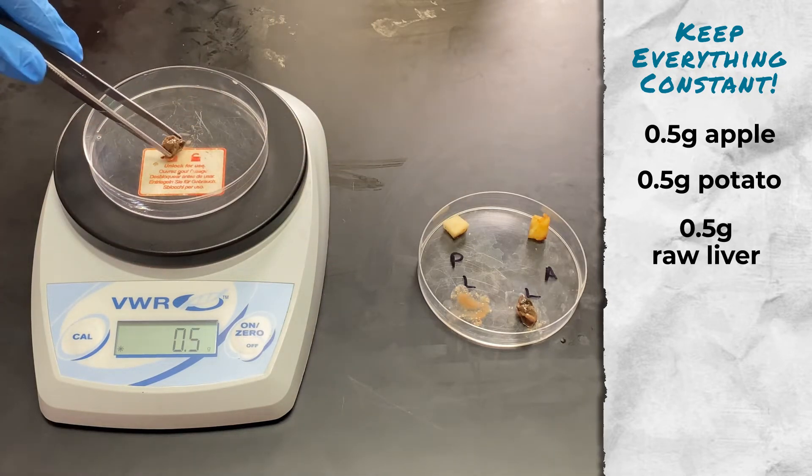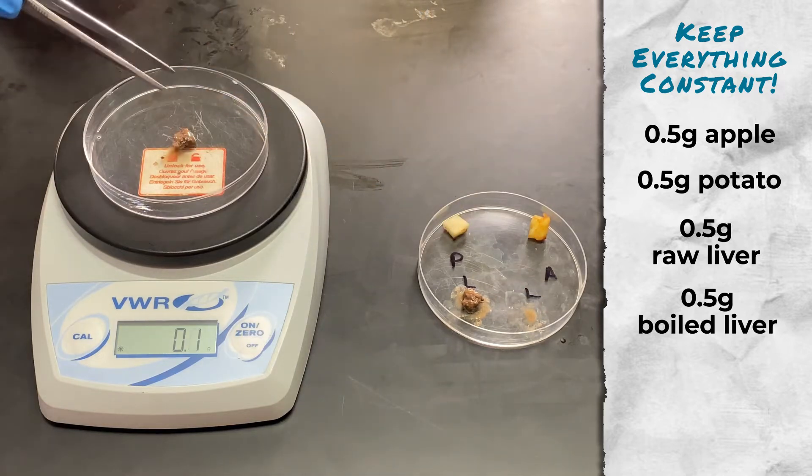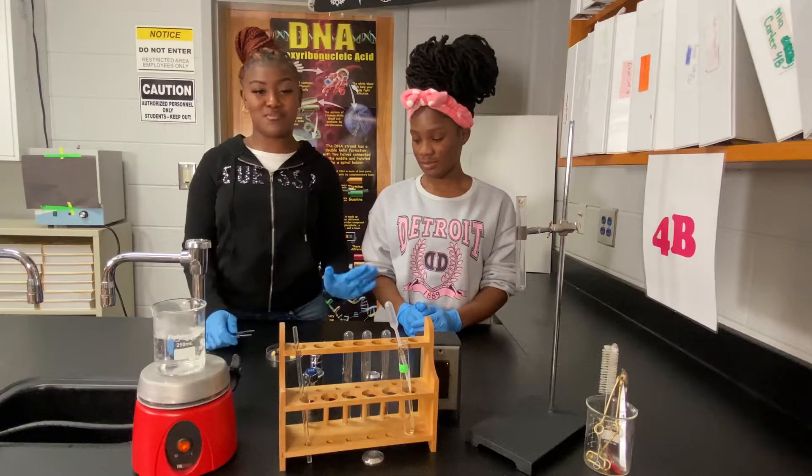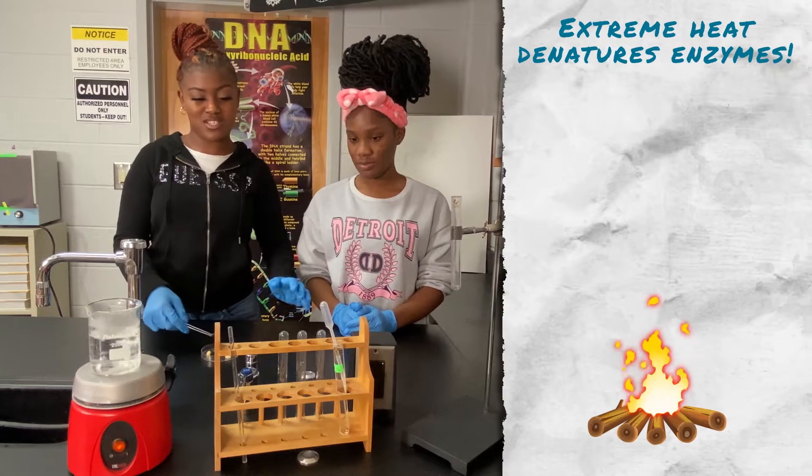We'll put one piece of liver into boiling water and one in a test tube with peroxide. Before we do the rest of our experiment, we have to put one of those pieces of chicken liver into boiling water.